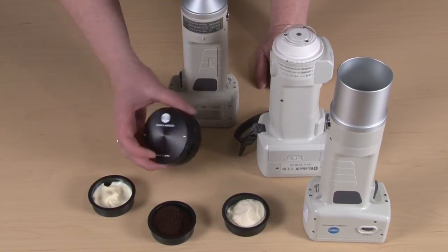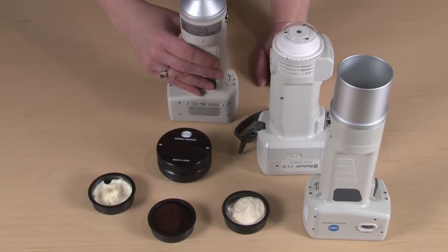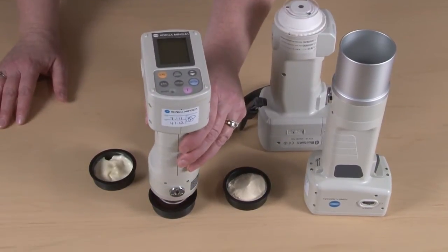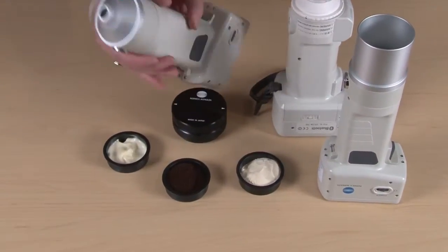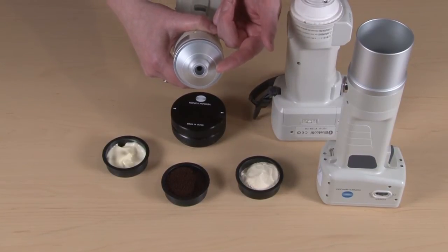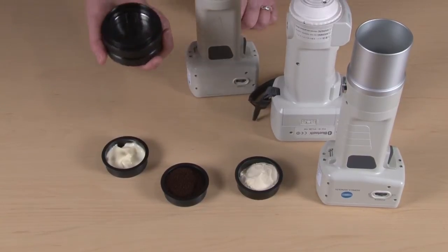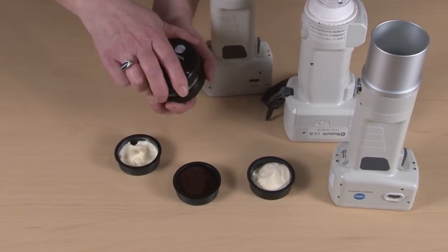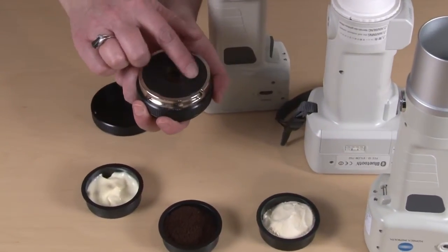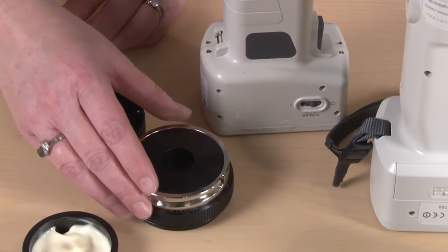This is the granular attachment. It's very easy to use and what it does is it protects the instrument from getting damaged. A lot of times people will want to measure the sample directly and when they do that the sample can actually get into the measurement head, cause damage, and inaccurate measurements. What we've designed to eliminate that is this granular attachment, which is really great to not only protect the instrument but to provide you with sample presentation and preparation that is consistent from one read to another.